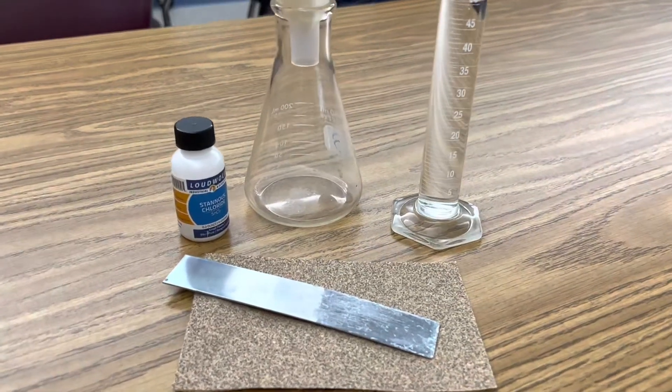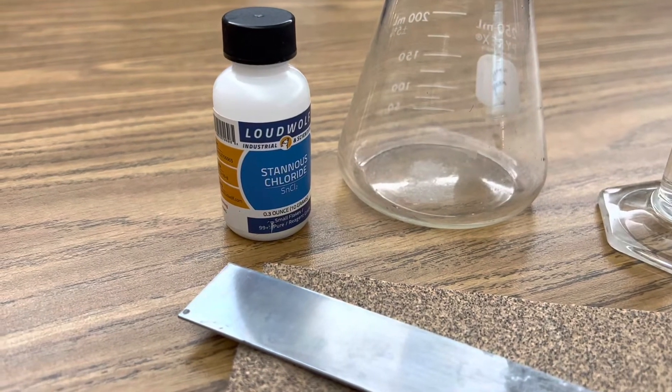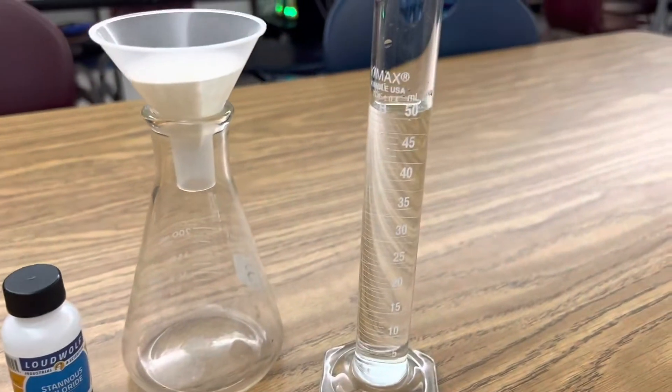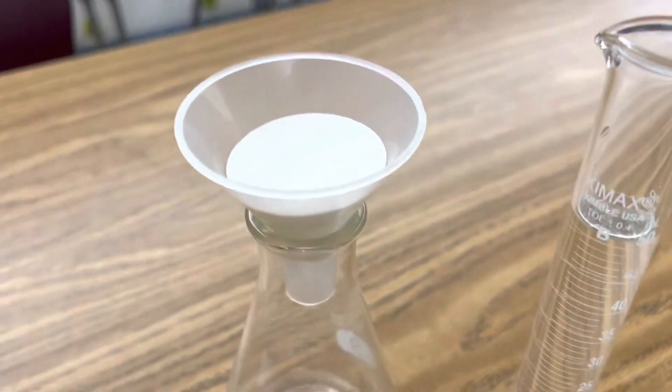All I'm using in a single displacement redox reaction is stannous chloride, also known as tin chloride, a strip of zinc, some sandpaper, 50 milliliters of distilled water, a flask, funnel, and filter paper.